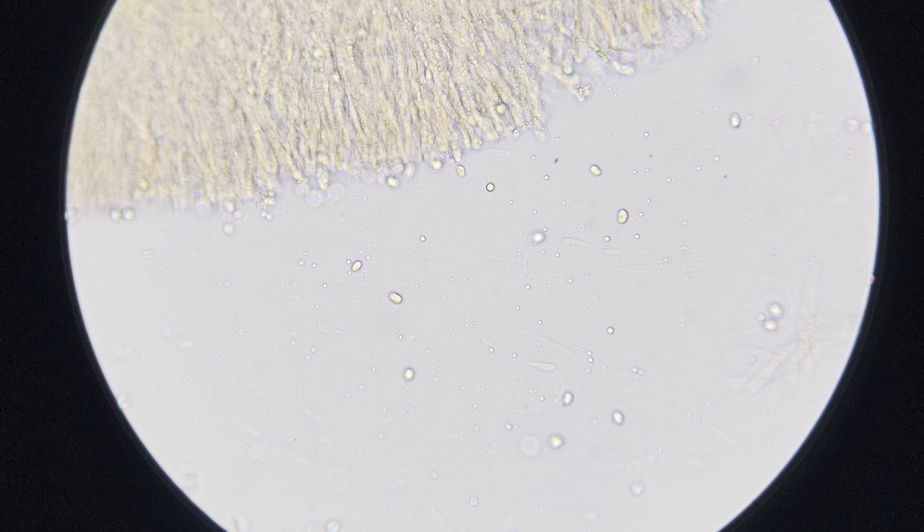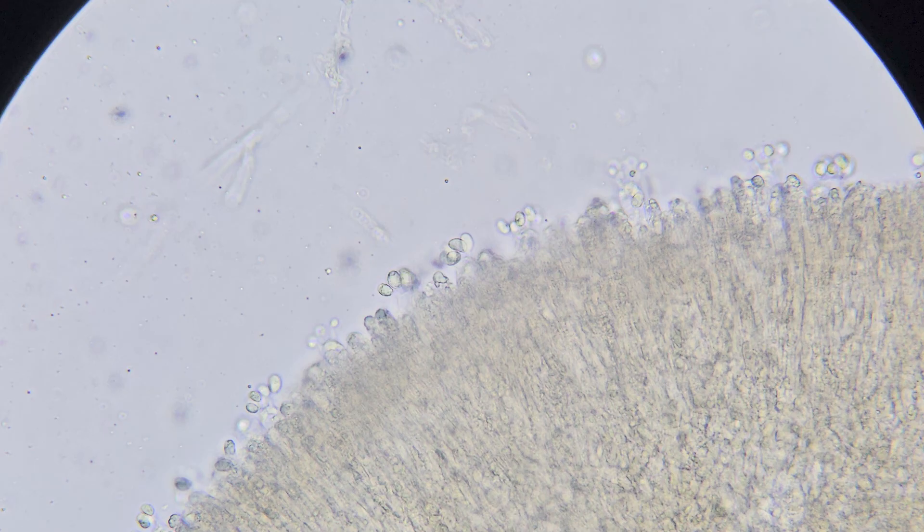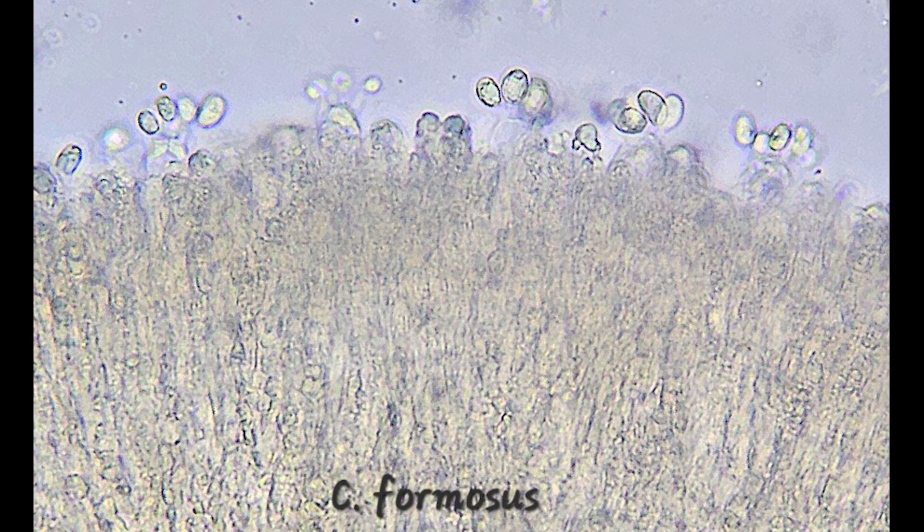In this next picture, we can start to see basidia arranged on the edge of the gill in really good clarity. This was a cool shot of a really nice cross section of the edge of that gill. And if you look down, it looks like a bunch of little balloons that are floating up above the fungal tissue — and those are actually the spores that are connected to the basidia.